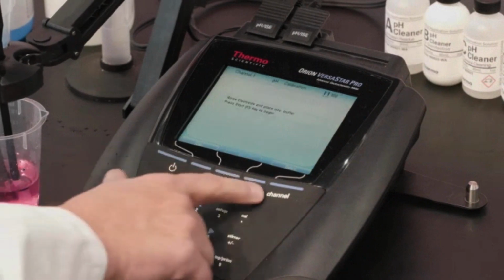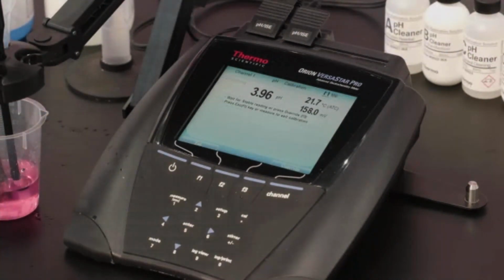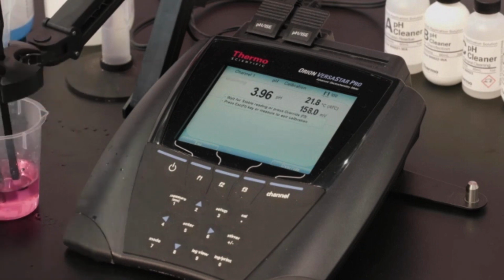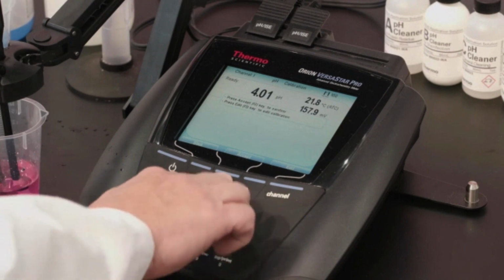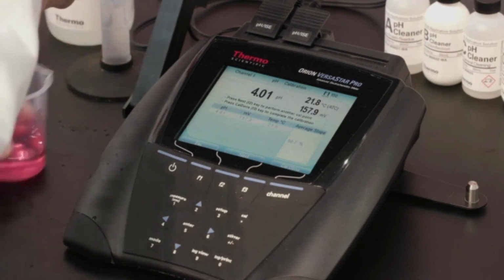There we go. So the stirrer will automatically start stirring. The Orion meter will automatically recognize the buffer, read the temperature and the millivolt value of the buffer, and assign the correct pH value for that buffer at that temperature. This is one reason why using a triode or an ATC is important. All right, so it looks like you have the ready signal there, Steve. So he can accept that, and there you go.